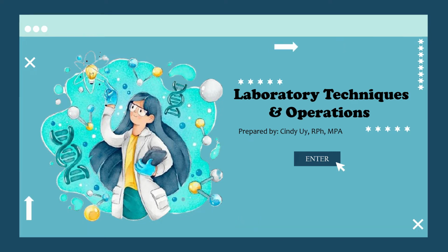While some of them involve the use of common laboratory equipment, from laboratory glassware to electrical devices, others require more specific or expensive supplies. Organic chemistry experiments involve many reactions to carry out a desired product that can be measured or weighed. These are procedures that contain a single or combined practice of mixing, transferring, heating, or cooling to a certain temperature. The main goal is to purify the crude product and obtain the specific purified compound or chemical.